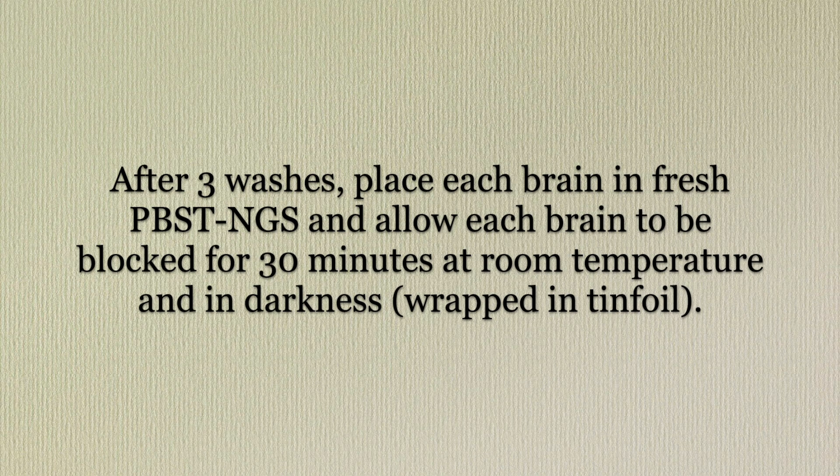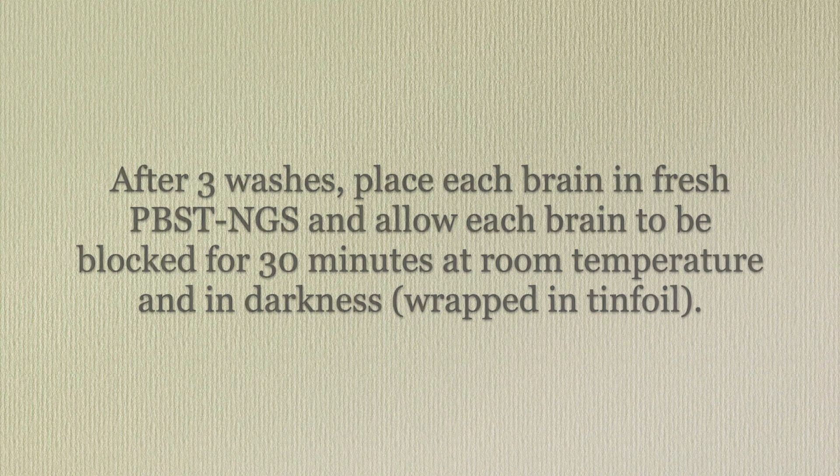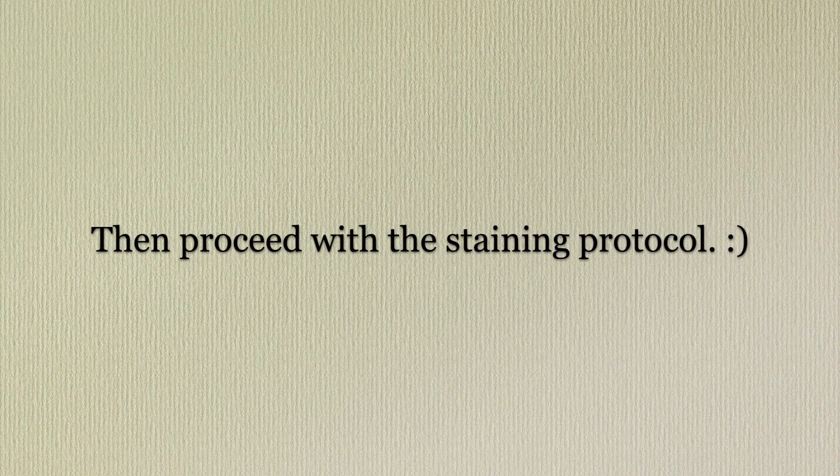After 3 washes, place each brain in fresh PBST-NGS and allow each brain to be blocked for 30 minutes at room temperature. Wrap them in tin foil. Now we can proceed with the staining protocol.